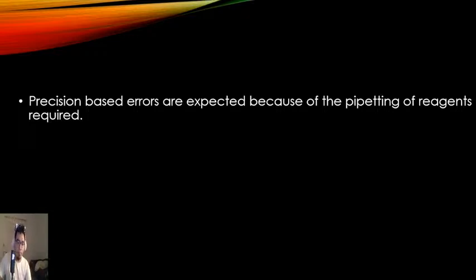Sir, precision means it gives the same repeated results. Very good. The reproducibility of the results. So will we have a problem when pipetting manually? Yes. If, for example, Adrian, Sir Marco, and I did the tests, so the three of us did the test.